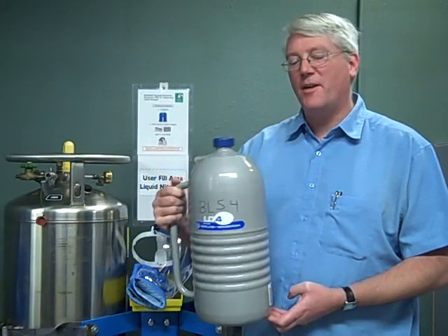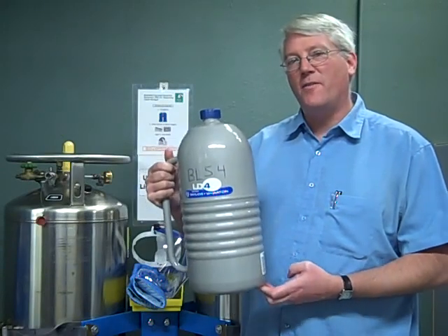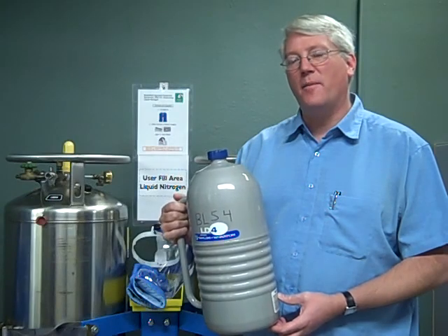Hi, I'm going to tell you about filling up a liquid nitrogen dewar so that we can fill the detectors over at the infrared beam lines.